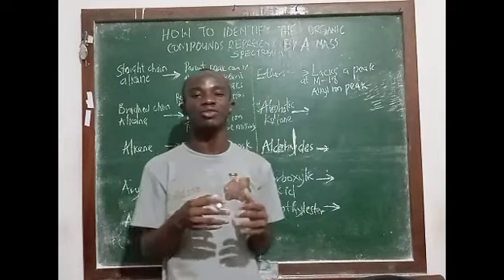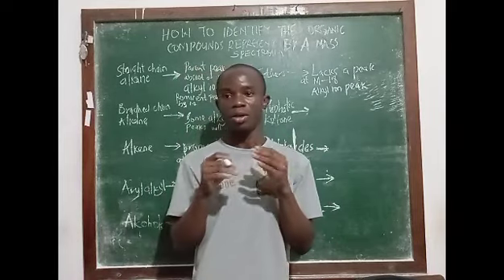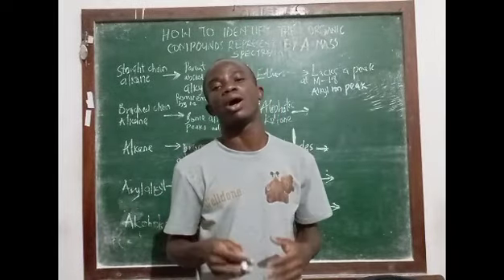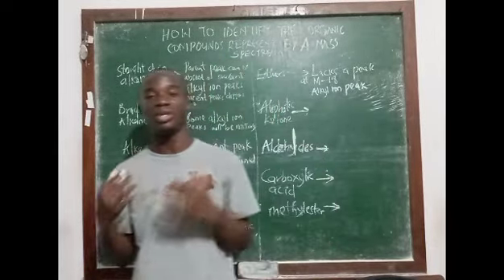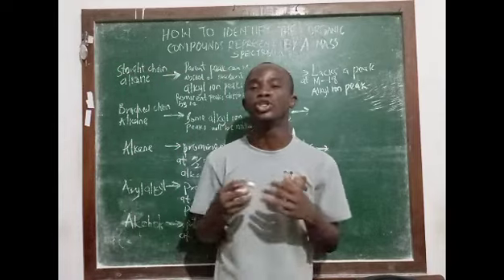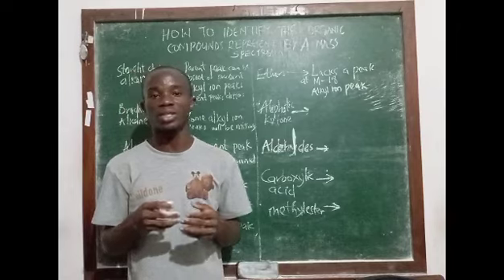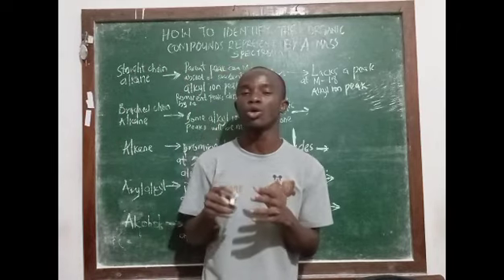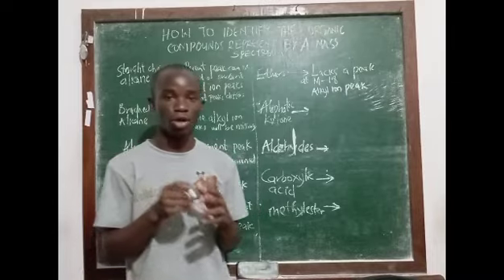helps us in identifying their mass spectrum, because when each of these carbonyl compounds undergoes McLafferty rearrangement, they produce specific signals which can be used to identify them, even though the position of their functional group can also change some of these values.